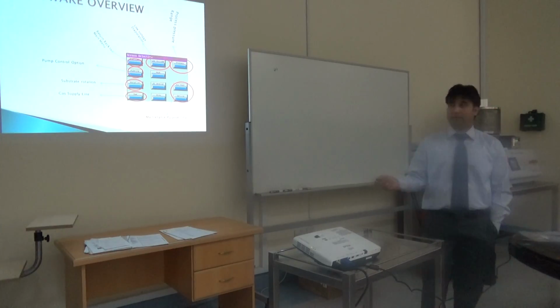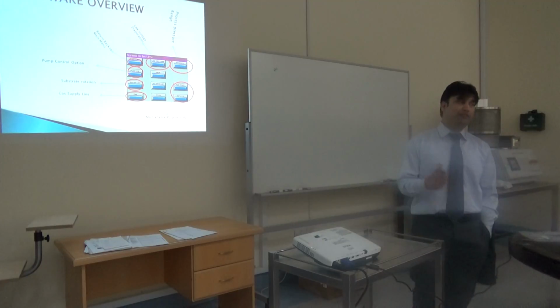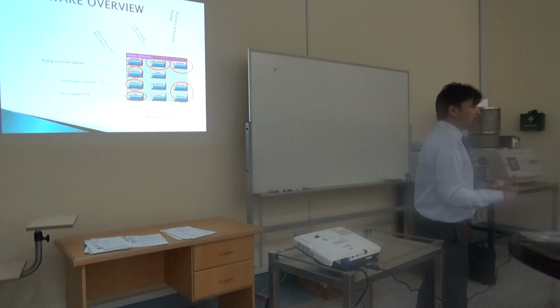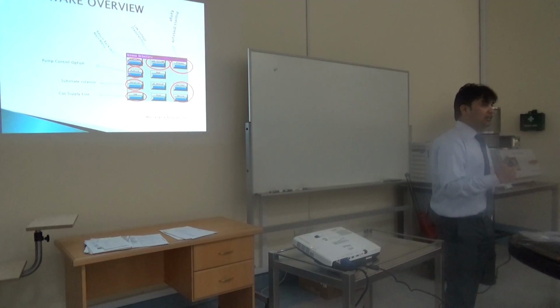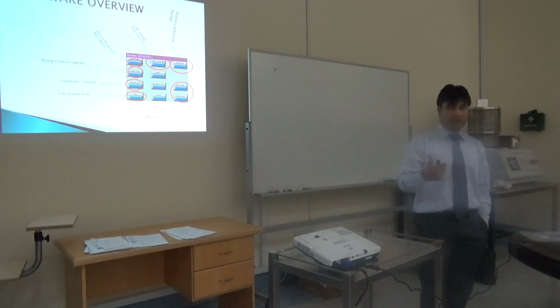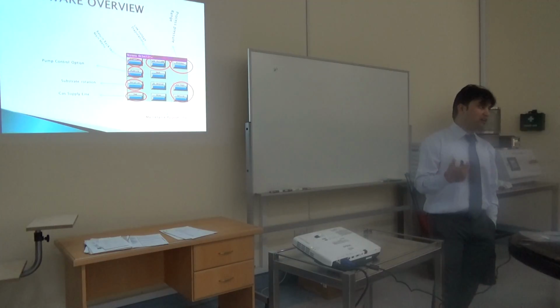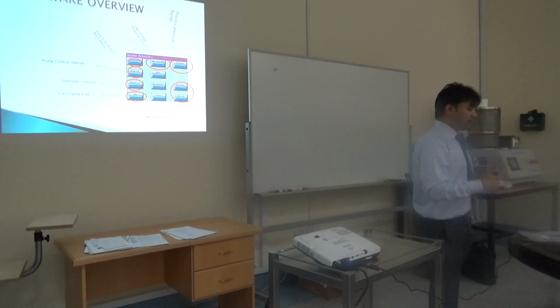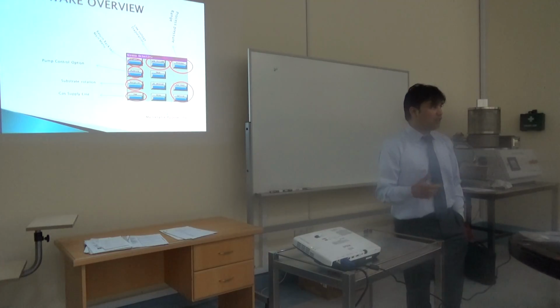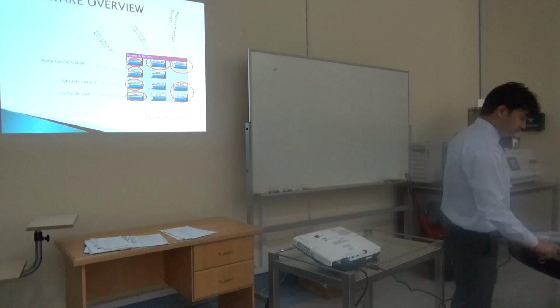Next, about the gas supply line. From the gas supply line, we can apply the external gas. For doing the sputtering, people in different labs use argon gas, because argon gas is very compatible for the sputtering process and for coating of the thin film.